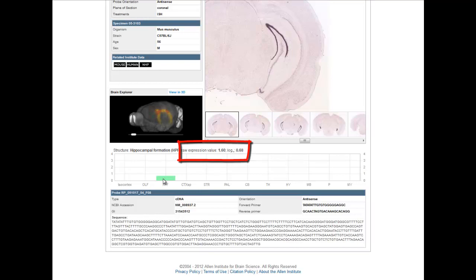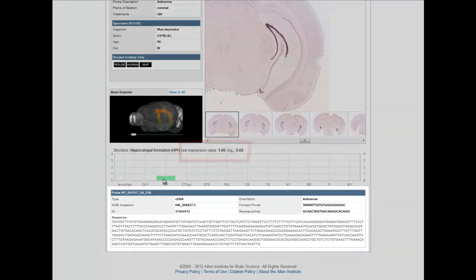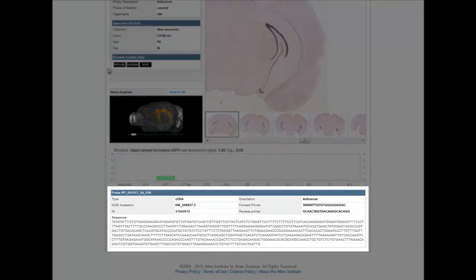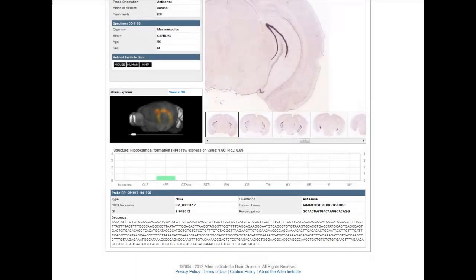We also provide you with the information required to create your own in-situ hybridization probes should you wish to repeat this experiment in your own system.